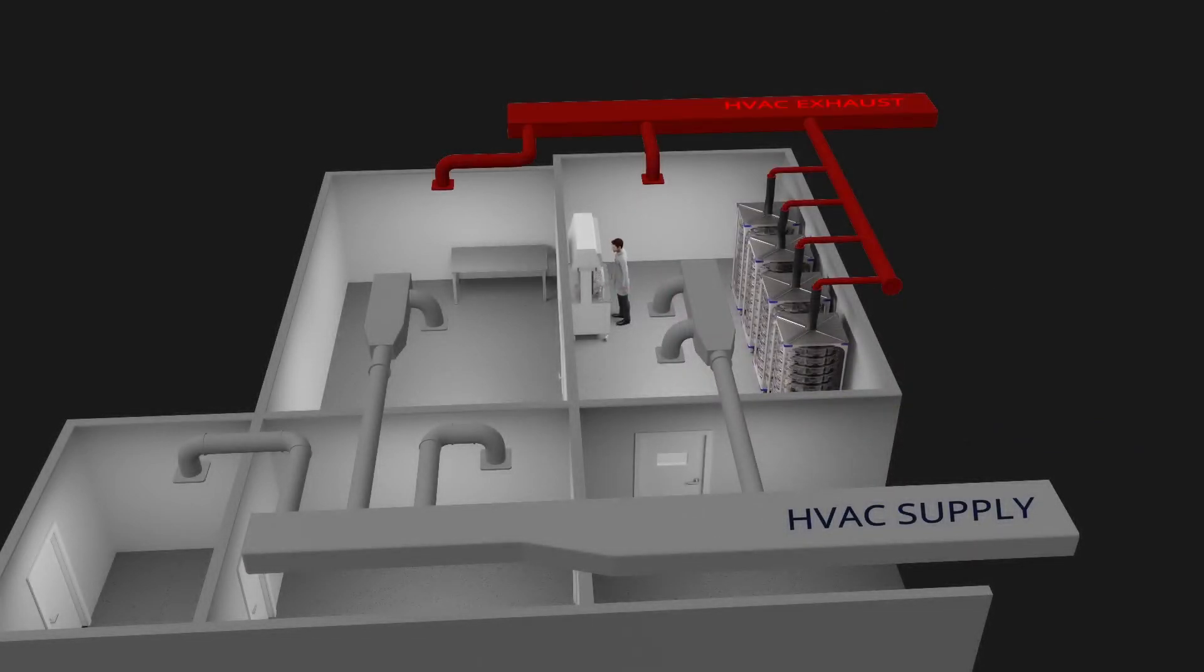The rack has one central plenum that captures the exhaust from all the cages on the rack.